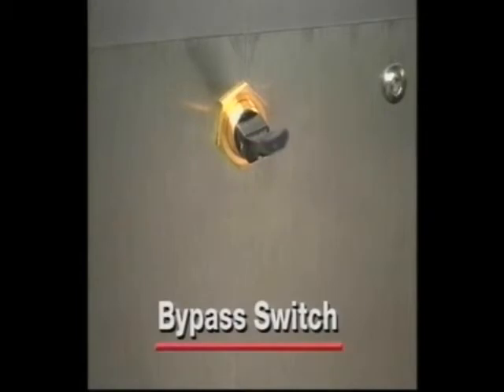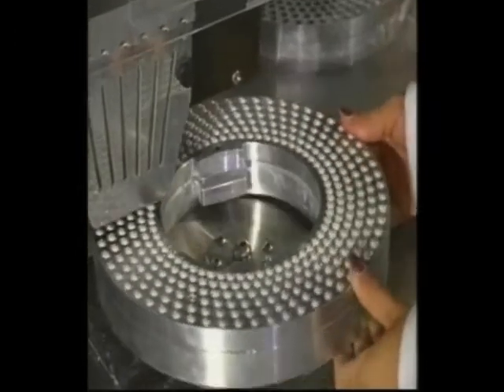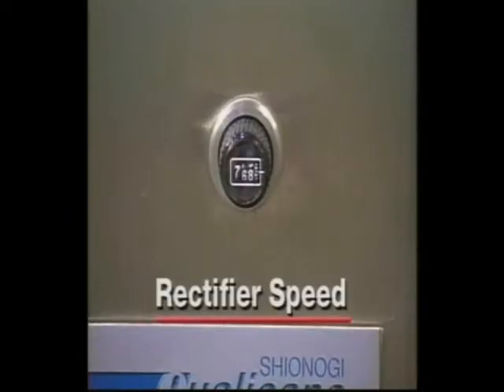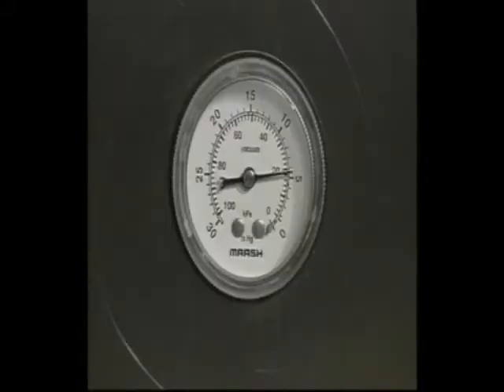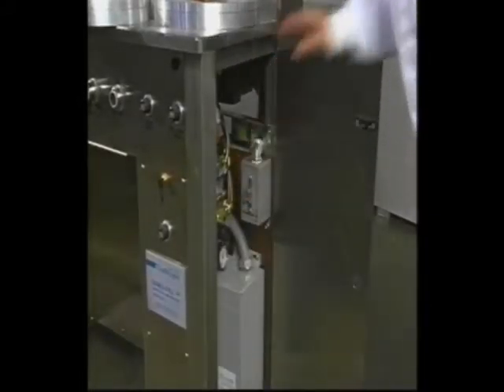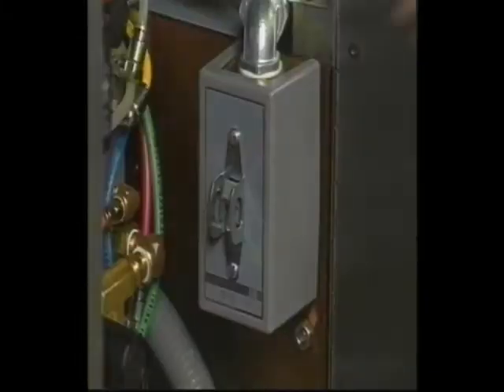There is an on-off switch for the vacuum pump and a bypass switch. The bypass switch allows the operator to adjust the vacuum without running the rectifier assembly. It can also be used to hand rotate a filling ring to ensure proper capsule separation. There is an auger speed knob, a fill table speed knob, and a rectifier table speed knob. The vacuum adjustment gauge is located outside of the left panel and allows you to adjust the amount of vacuum under the rectifier table. Inside the right panel, you will find the main power switch, which controls power to the entire machine. It should be turned off at the end of a shift or to isolate the machine for maintenance or cleaning.